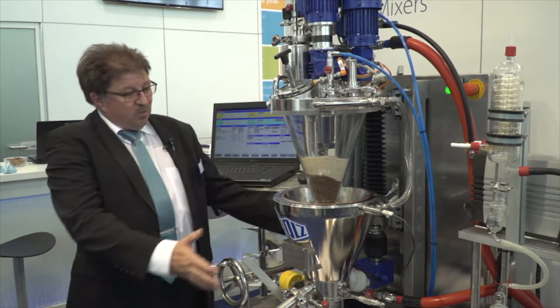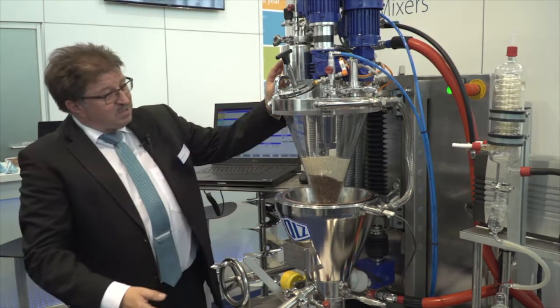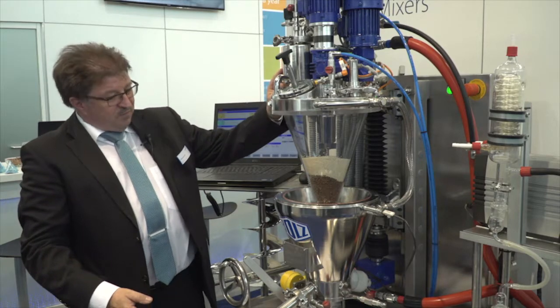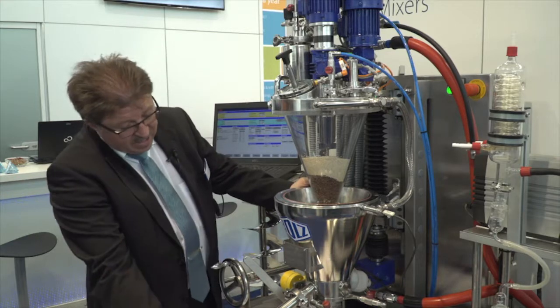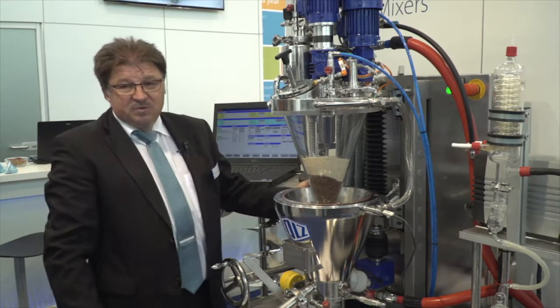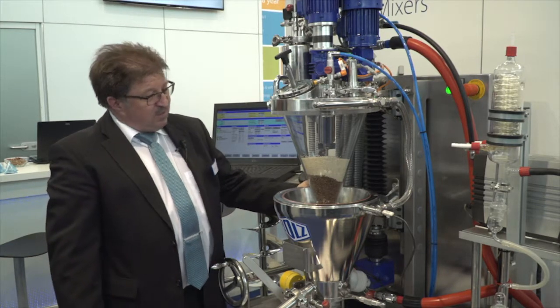A complete system with a core unit of a conical orbit arm dryer, with a dust filter on top for separation of the dust, a little sampler with an outlet valve, a heating system for heating of that unit, a vacuum pump to create the vacuum, and a little condensing system to recollect the solvents.